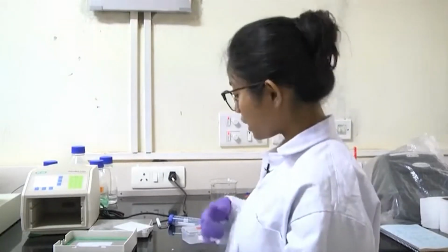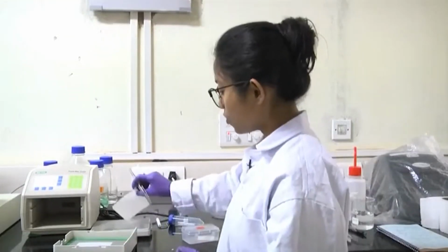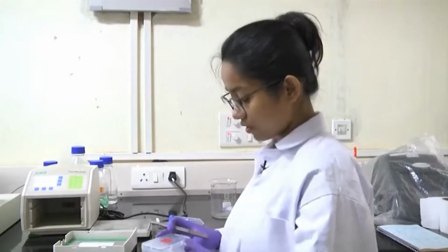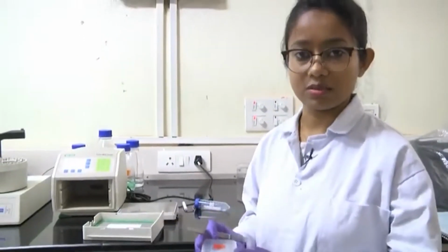But if you see later on that there is much more noise while detecting your protein, you should go for more time during the blocking. If the blocking is not proper, then there will be noise. So now I will keep this in the rocker for 2 hours in constant rocking motion, and after 2 hours we will wash this membrane and then go for the primary antibody incubation.